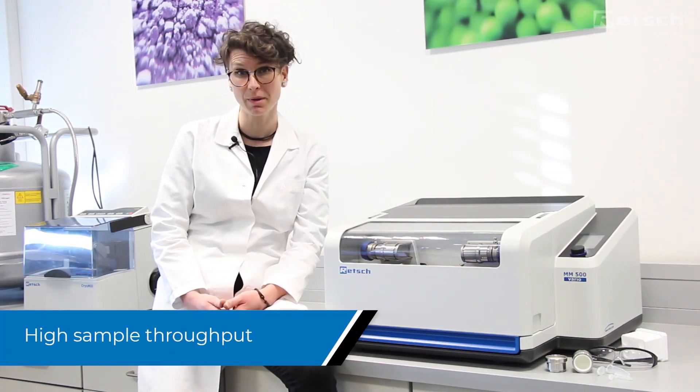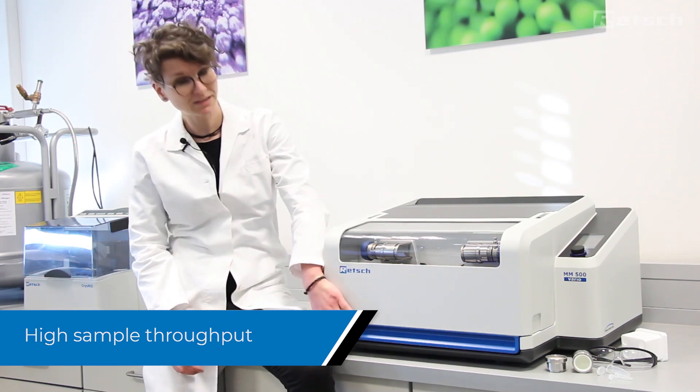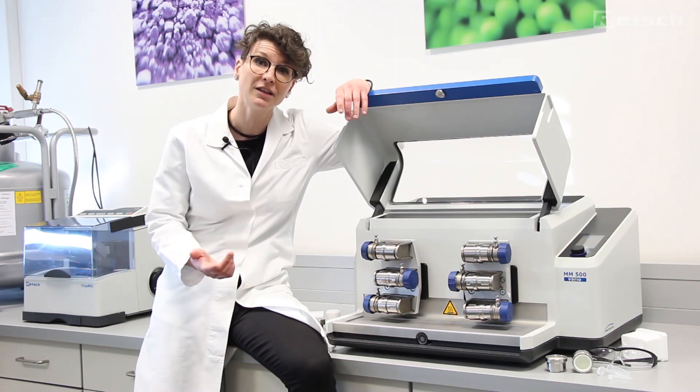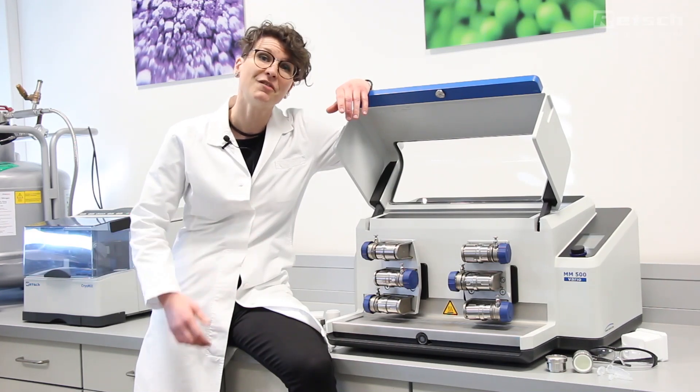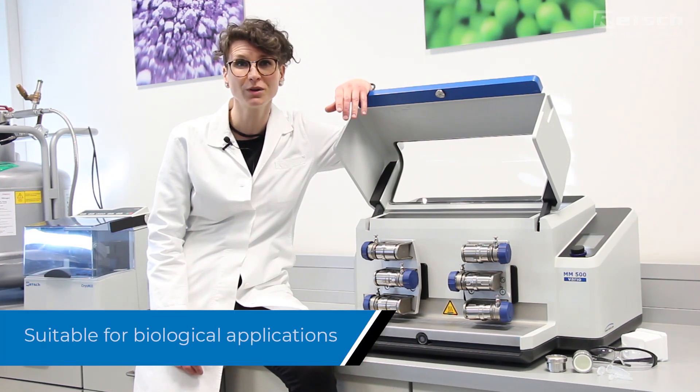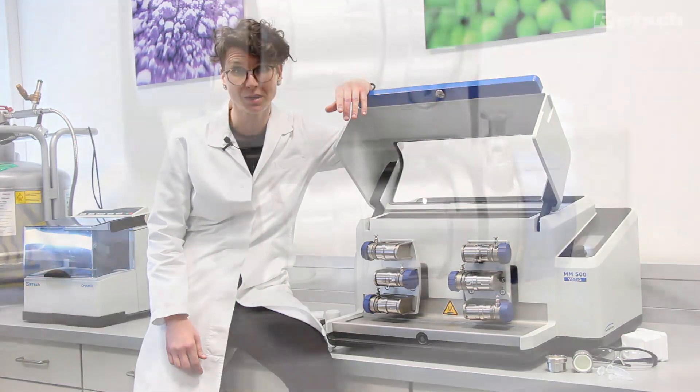Hi everybody! In this video we'd like to introduce our new Retsch mixer mill MM500 Vario. The Vario is a specialist for high throughput within the MM500 family. Six grinding stations allow for the pulverization of hard, medium-hard, soft, fibrous or elastic sample materials. The instrument is also suitable for classic biological applications like bead beating for cell disruption.